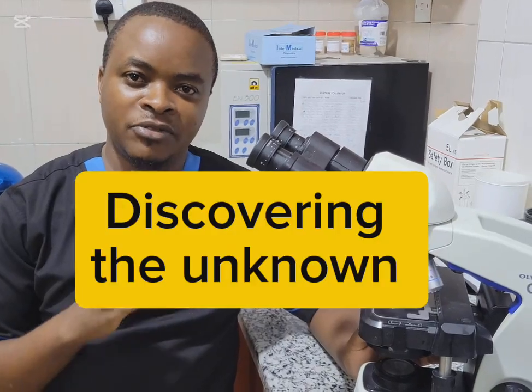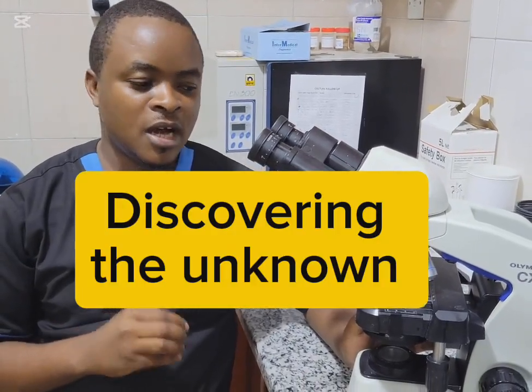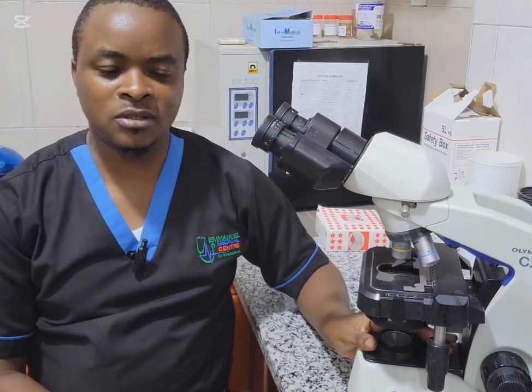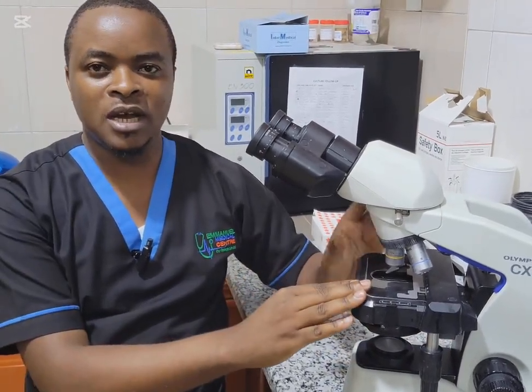Story, I want to take you through the principle behind the microscope, which is the heartbeat of medicine, discovering the unknown. And this light microscope works, it has the light source where we put the specimen and the opticals.